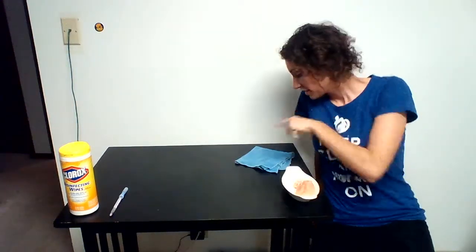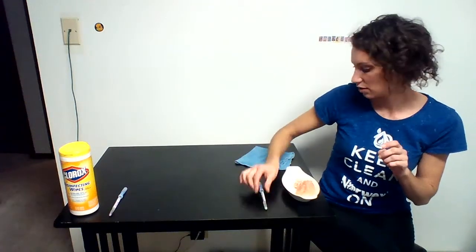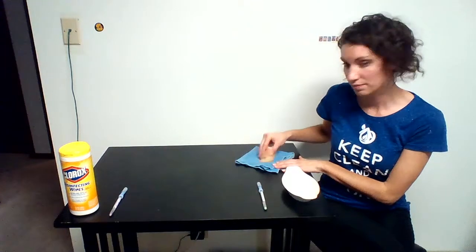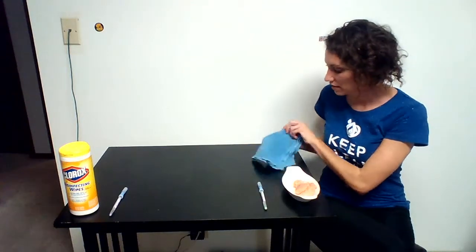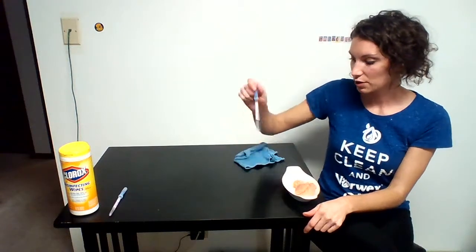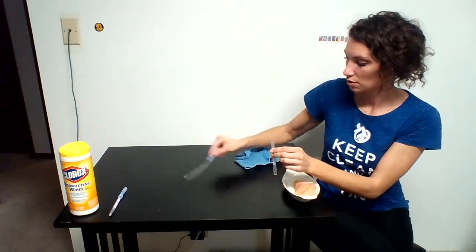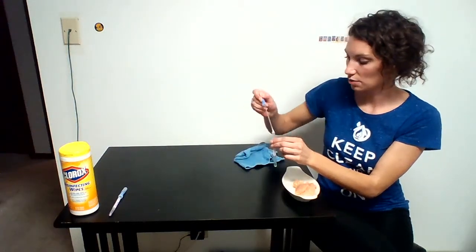Now I'm going to show you how these cloths actually trap the bacteria inside the fibers and won't cross-contaminate. I have the cloth that we used for the Norwex wipe. I'm going to take the raw chicken, wipe it on here, and then take this same side I wiped it on and wipe it on the surface. Then I'm going to take that same swab I was using earlier to test for any cross-contamination from the raw chicken I just rubbed on the cloth.